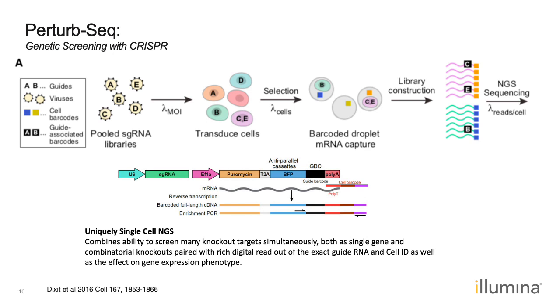And one of the most popular methods of combining single-cell RNA-seq and guide RNA detection is a method by the name of Perturb-seq, which combines droplet-based single-cell RNA-seq with a strategy for barcoding CRISPR-mediated perturbations that allows many perturbations to be profiled together, making it compatible with these large screens.